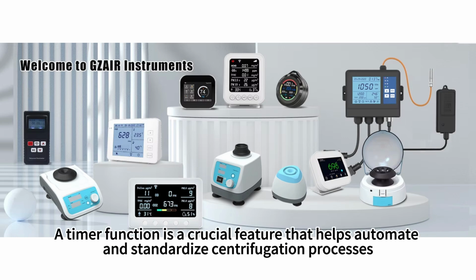A timer function is a crucial feature that helps automate and standardize centrifugation processes.